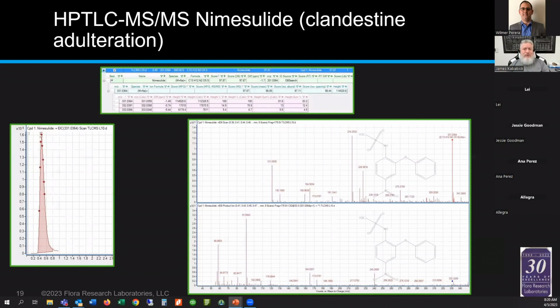This technique can be used for synthetic cannabinoids and cannabis products. It can be used for pharmaceutical adulteration, virility products, blood sugar support, and a variety of other applications. It's a great technique for unknown compounds. There have been a number of times where people are stuck on a determination of authenticity with a botanical because a band shows up they haven't seen before, and they're not sure if this is variation within the species, or regional harvest or weather conditions, what have you, or is this representing confounding species adulteration? With desorption into the mass spec, you could rapidly interrogate the band and get more data, which we love to be able to do.